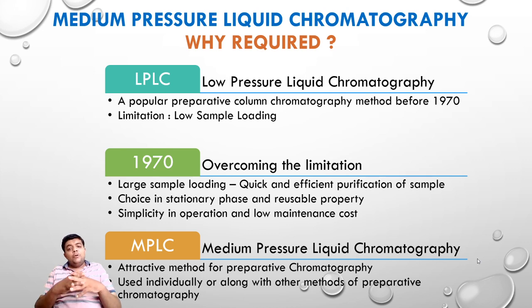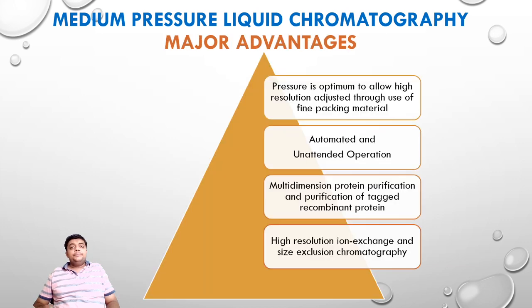MPLC is an attractive method for preparative chromatography. It is used individually or along with other methods of preparative chromatography. So this was just an outline about medium pressure liquid chromatography. What are the major advantages of this MPLC?